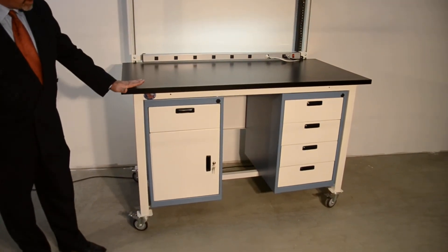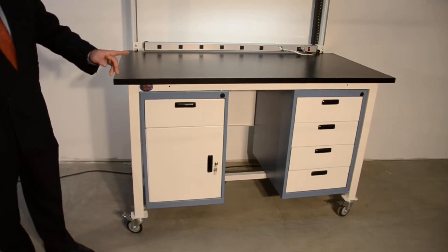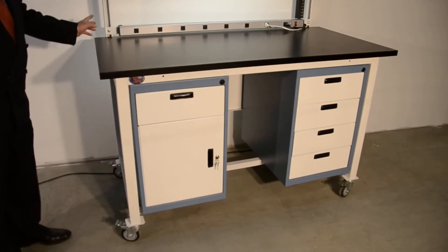Base workbench comes with a work surface, left leg, right leg, front rail, back rail.